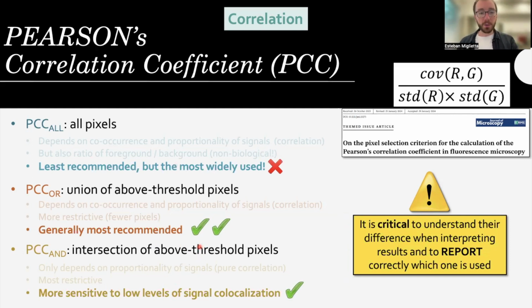It's important that you know what you're using whenever you use it. I would say of all, the PCC all is the least recommended, because again, it's highly dependent on things that don't have to do with the underlying biology. However, in most bibliography that I've ever read, it's the most widely used.